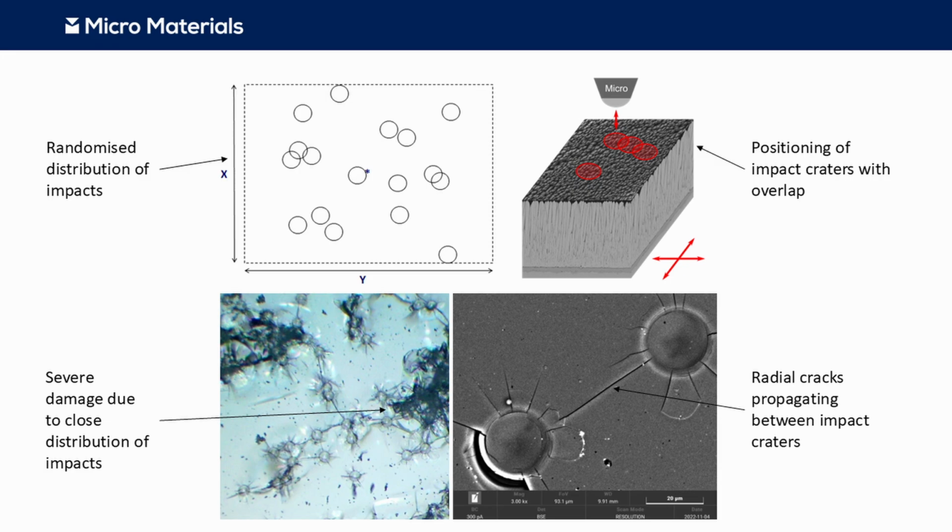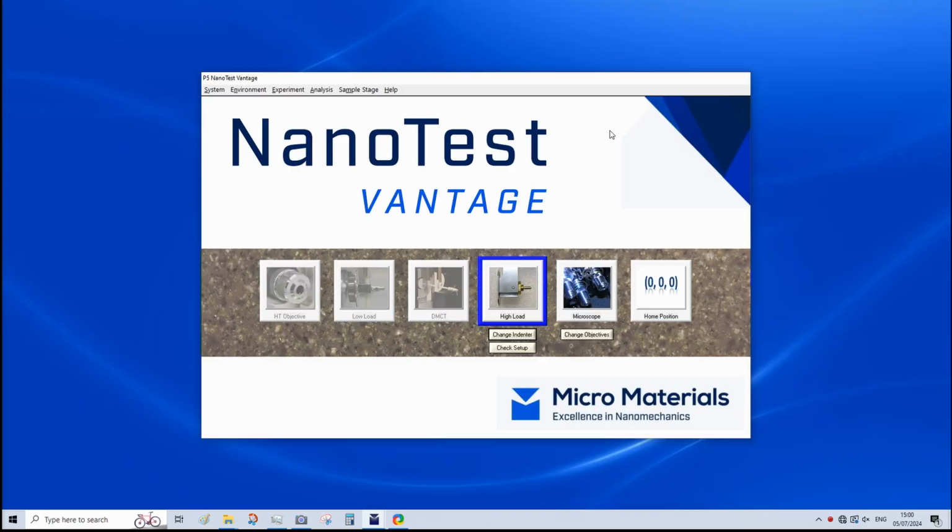This allows for simulation of impacts in a methodology more similar to erosion, where particle impacts impart energy across an area. The technique is particularly well suited for studying damage mechanisms on thermal barrier coatings and exhibits good correlation to erosion tests, both in terms of damage mechanism and wear rate.